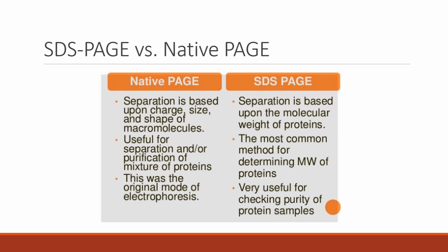So here's just a side-by-side comparison of SDS page and native page. Remember, the native page separation is going to be based on the charge, the size, and the shape of the proteins, whereas in the SDS page, we're only going to separate based on the actual molecular weight.